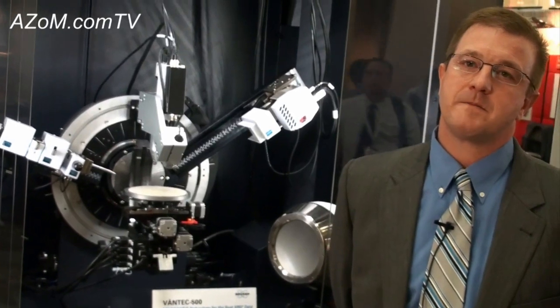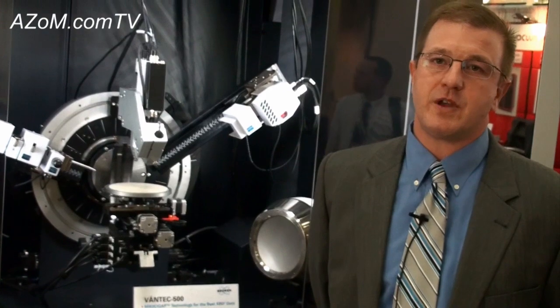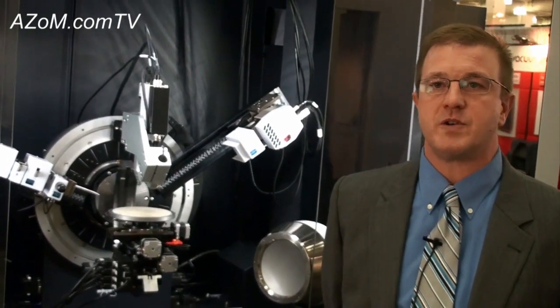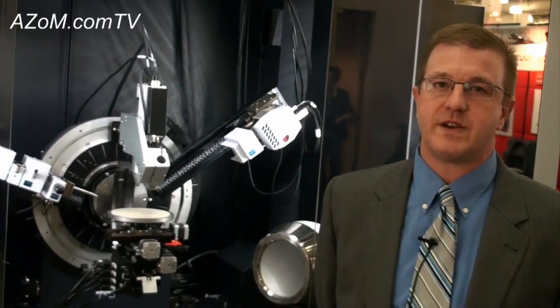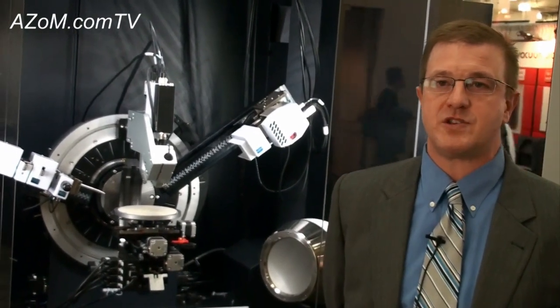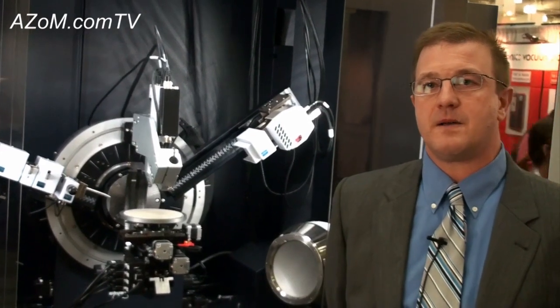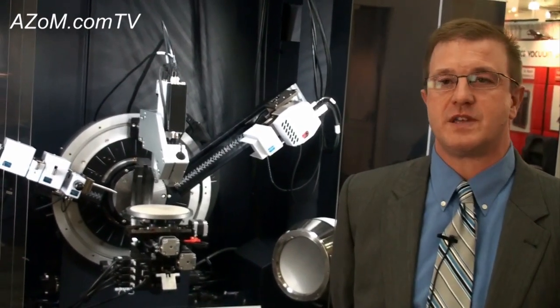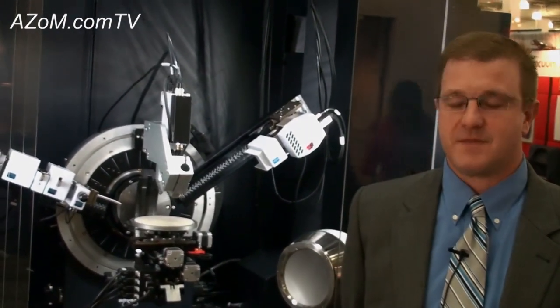All right, Peter, and if anybody wants more information on what the new D8 Discover can do, where can they go? They can go to www.bruker.com and go to the x-ray portion. That is the best way to get a hold of us. And there's plenty of information there with regards to application notes and different pieces of literature that you can download there as well. All right, Peter, thanks very much for telling us about the D8 Discover. Thank you.